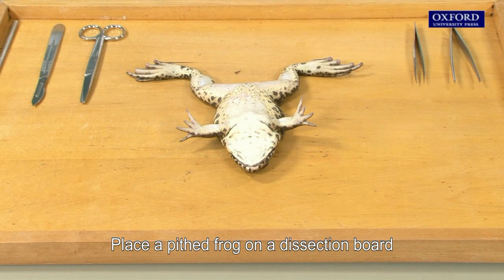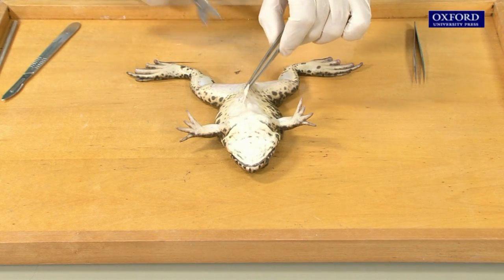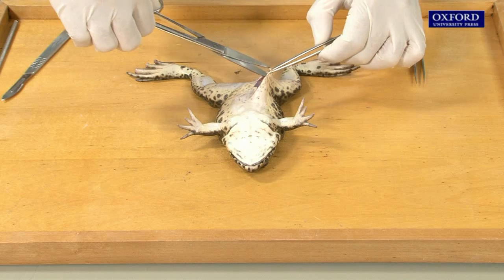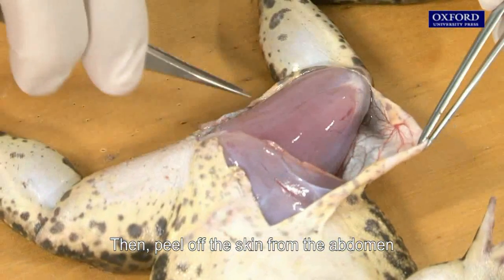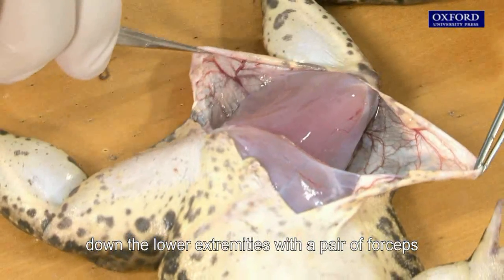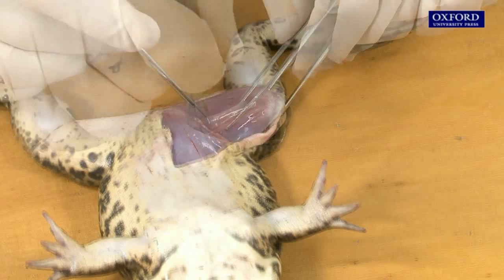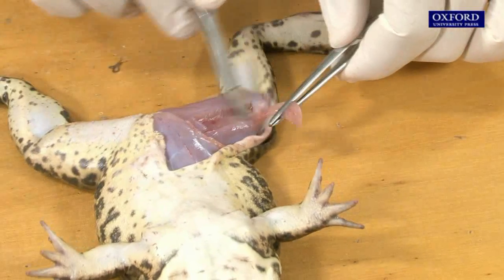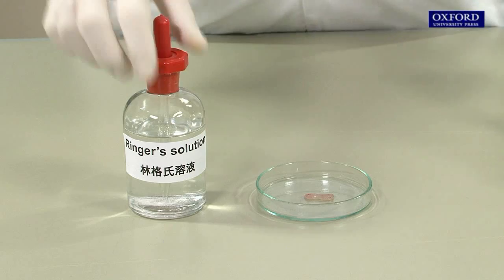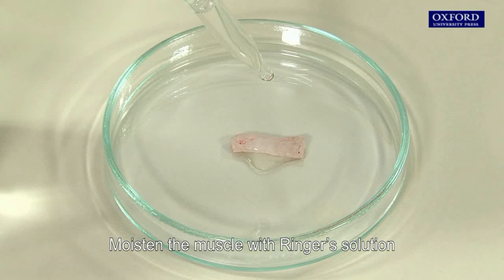Place a pithed frog on a dissection board with its abdomen facing upwards. Cut open the skin of the frog, then peel off the skin from the abdomen down the lower extremities with a pair of forceps. Cut a small piece of thigh muscle and put it into a petri dish. Moisten the muscle with Ringer's solution.